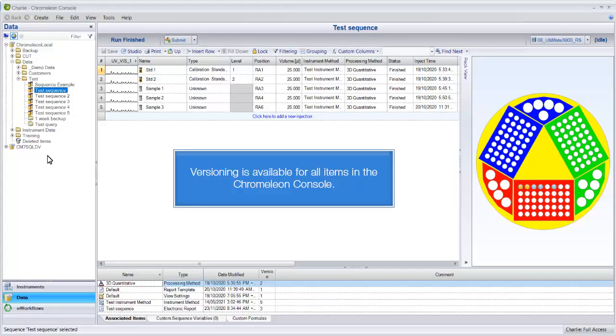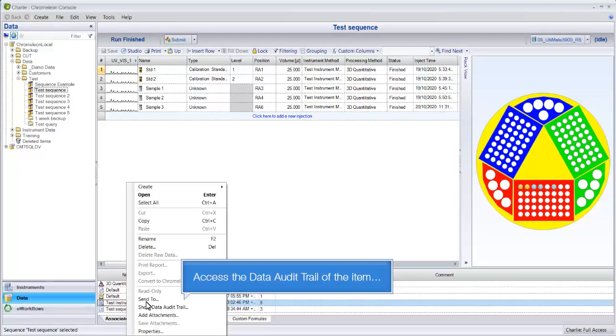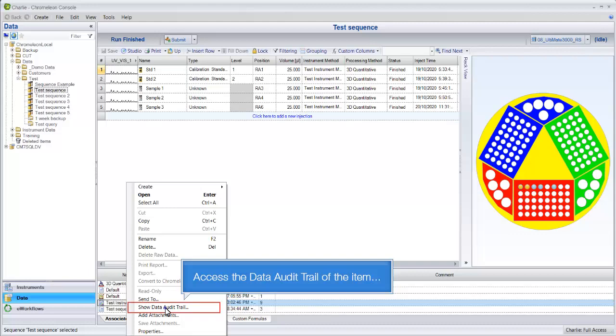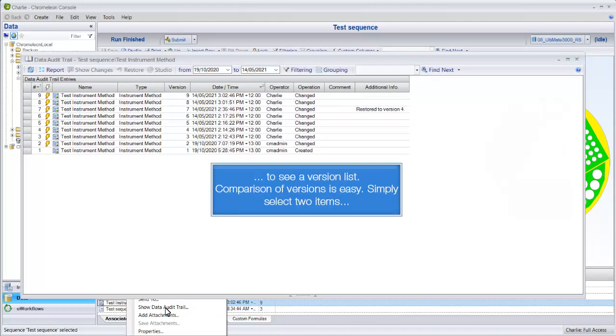Versioning is available for all items in the Chromelion console. Access the data audit trail of the item to see a version list.